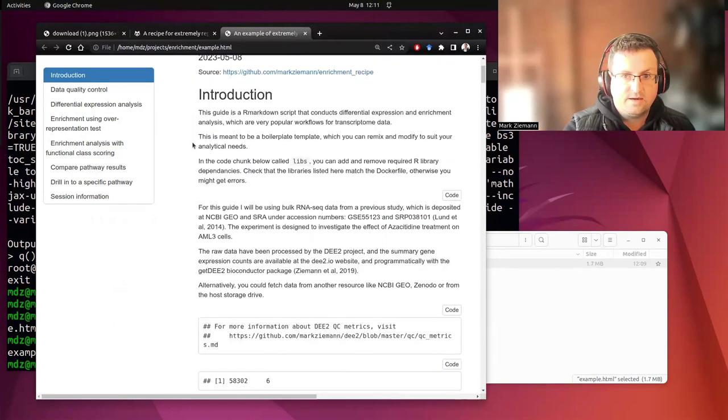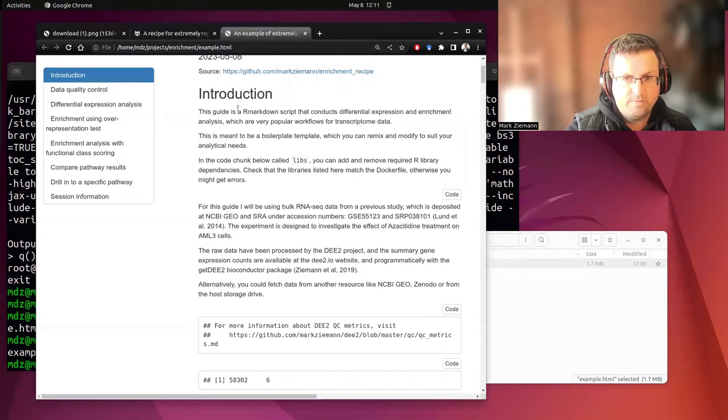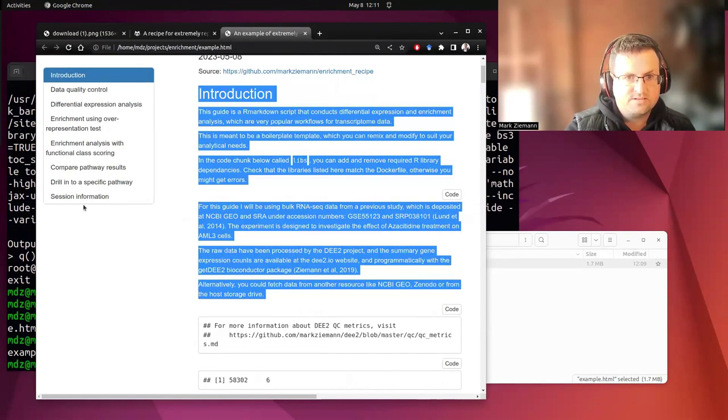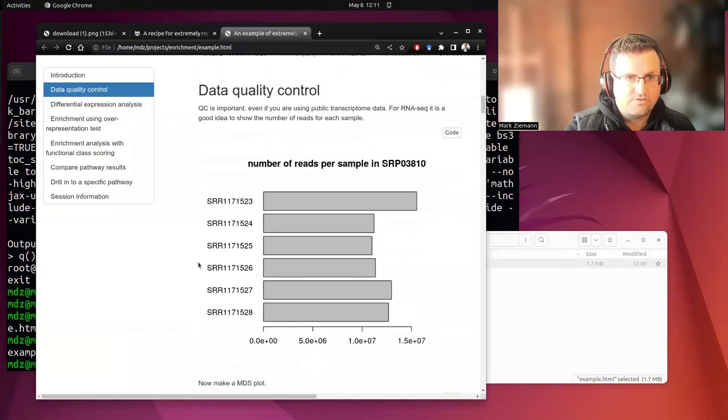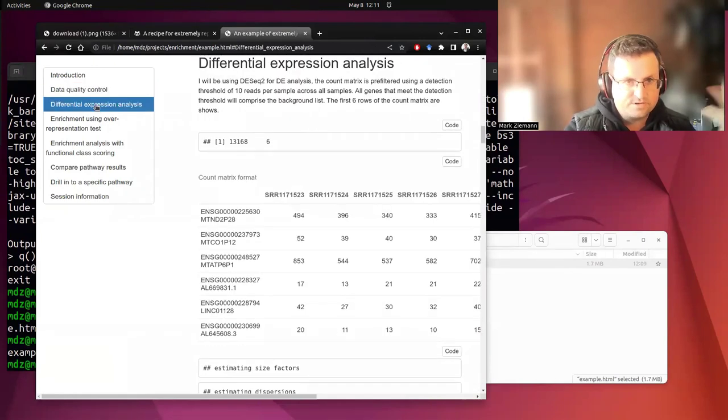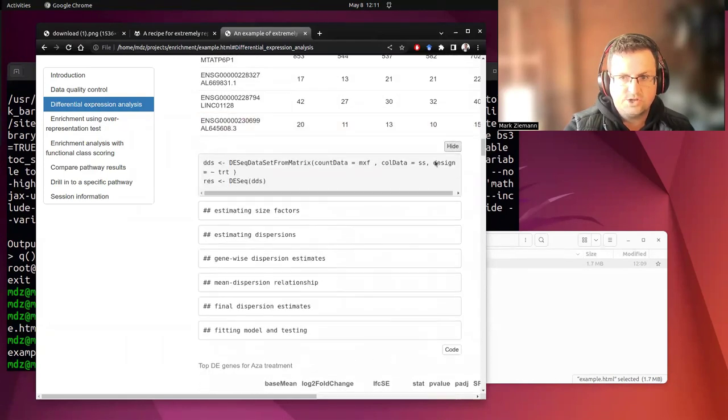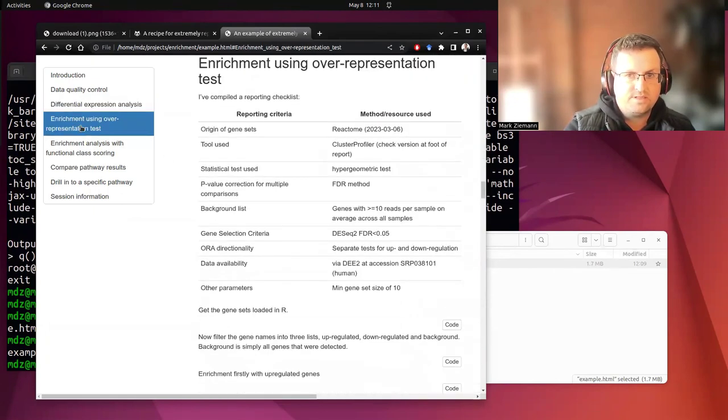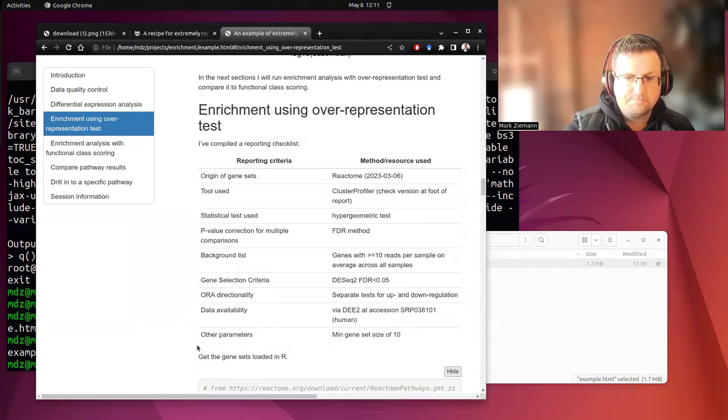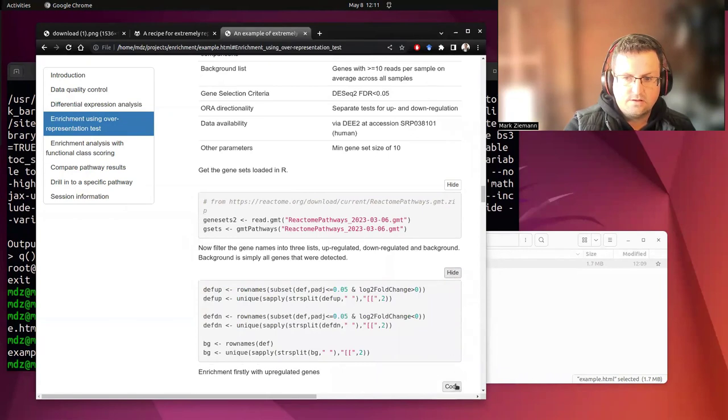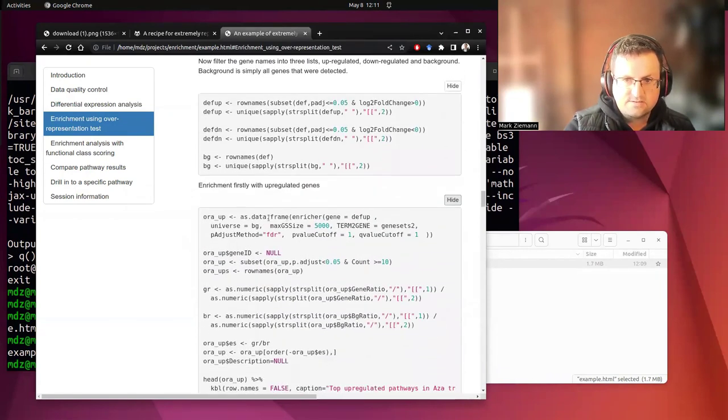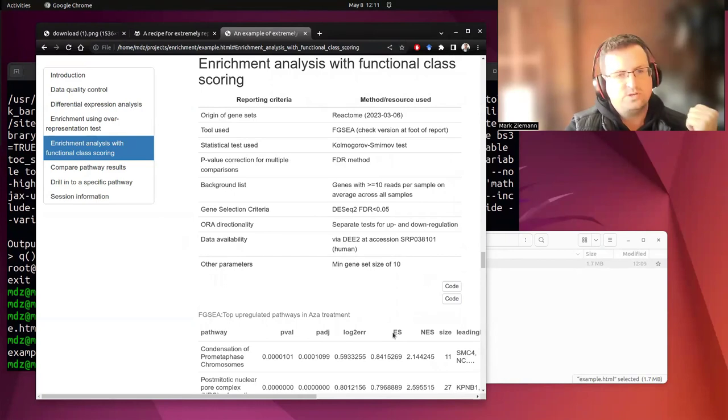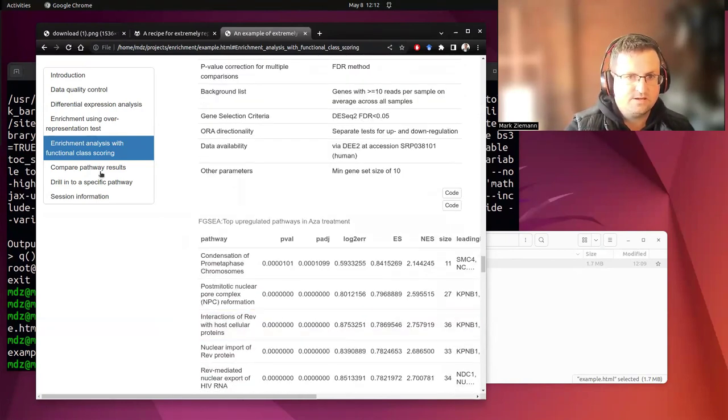Okay. So here we have that freshly produced R Markdown report. And as you can see, it's in the typical Markdown format with lots of background explanation, a table of contents here. So we can have a look at how the quality control was done. All the different steps, differential expression with DESeq and all the code is here in the chunks there. There's the DESeq code. Here we go with the enrichment using the over-representation tests with ClusterProfiler.